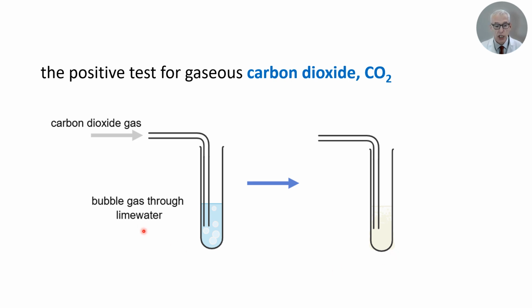Okay, so you bubble the gas through lime water, which is calcium hydroxide solution, and you get a milky white suspension as the positive test for carbon dioxide.